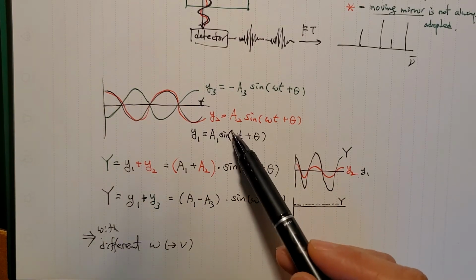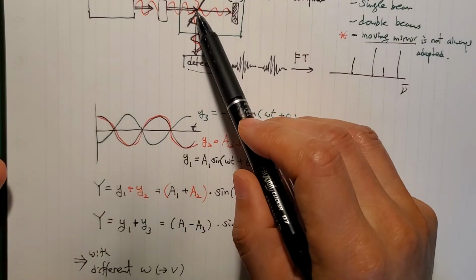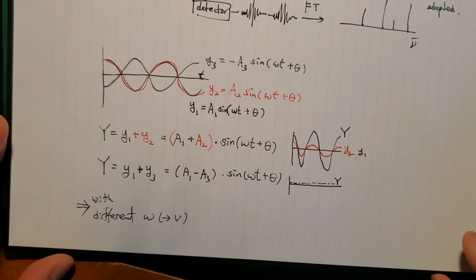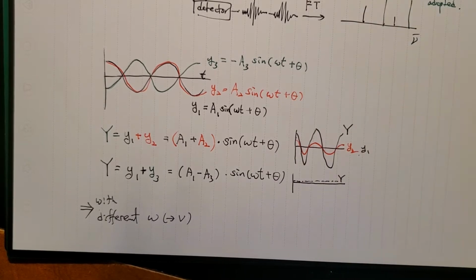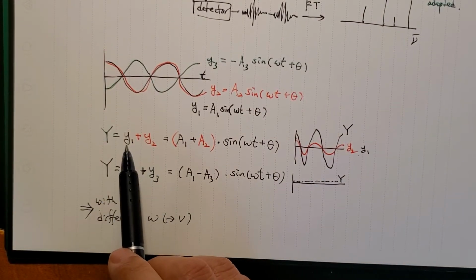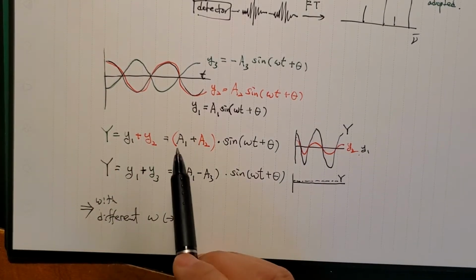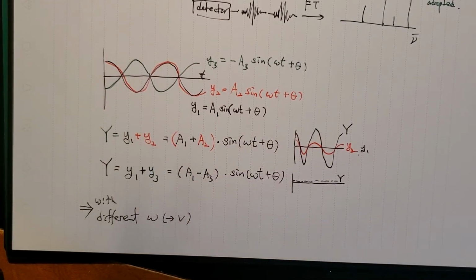Say you are making these 2 lights interact right here at the mirror to generate the interferogram. So the interference is taking place, and you heard about constructive and destructive, but those are too extreme, and we'll have to apply to the partial interference, right? But let's just say you have photon wave 1 and 2 interfere, then what happens is you have a twice intense light with the same frequency.